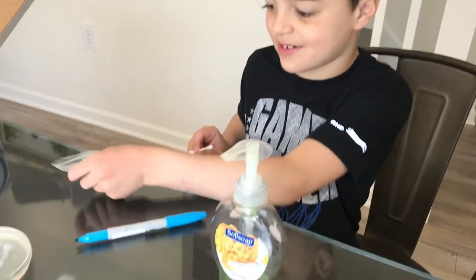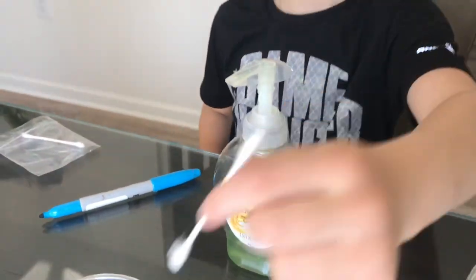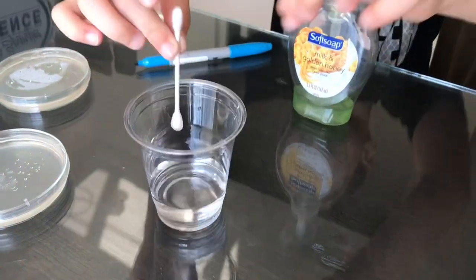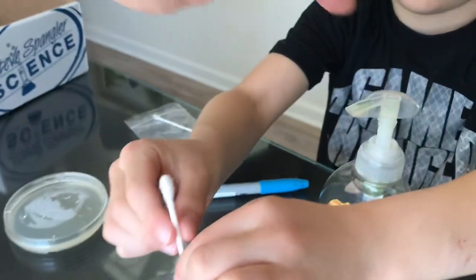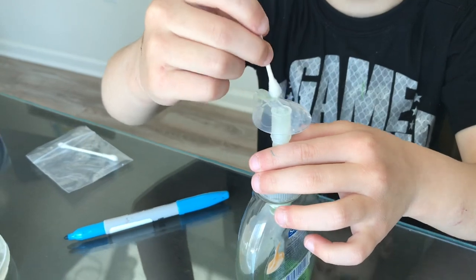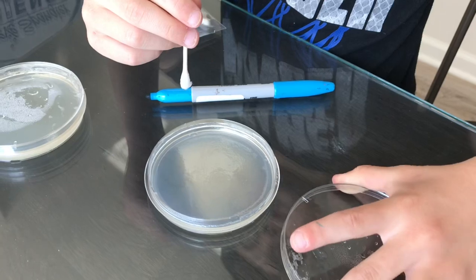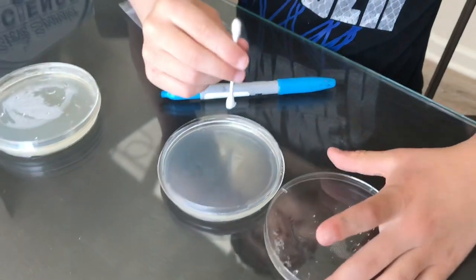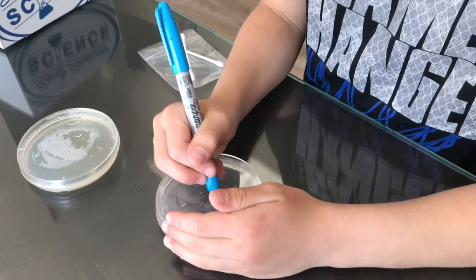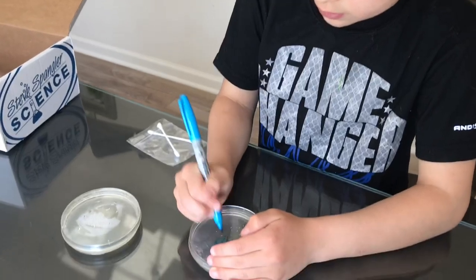I bet this is dirty. I have a feeling this one's gonna be dirty too. Yeah, think about it — you touch it before you wash your hands. So you want to get the top part. Good job. It's important to always keep the lids on and take them off only when you're going to apply the bacteria, so that way you're not getting other bacteria in there. O-A-B. Good, put it aside.